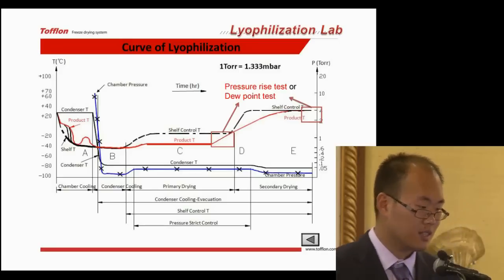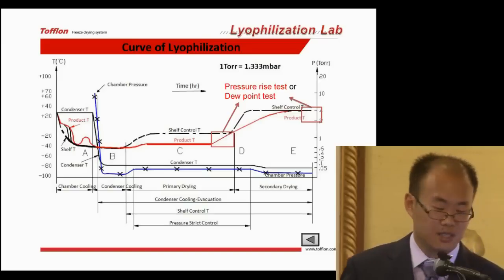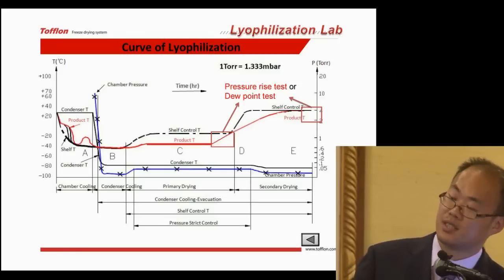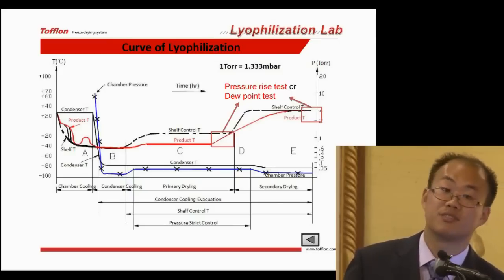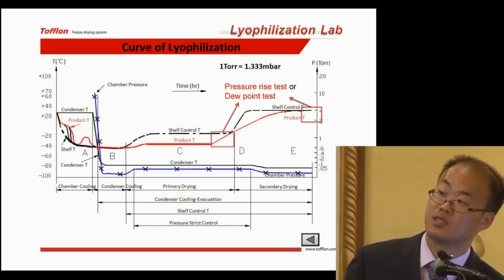So after all, we talk about the freeze drying cycle. If we give you a report, it's just like this. On the left, the right curve is a freezing curve. Now we decrease the temperature, and at this point the latent heat is released. Just look at it as solidification: the liquid becomes solid. And at this point, we decrease the pressure. Now, as the blue curve shows, we decrease the pressure, so we go into the drying step.